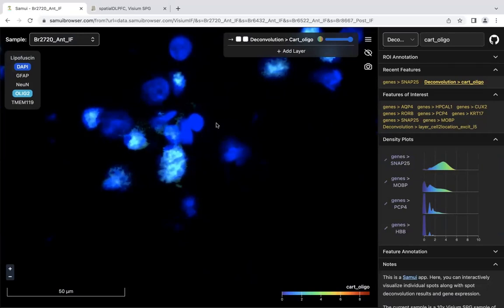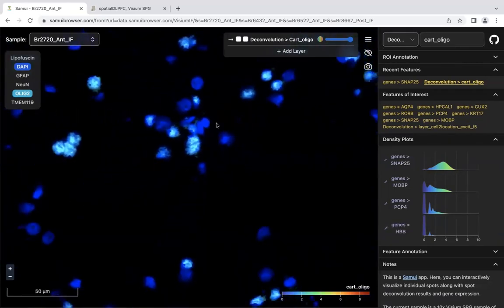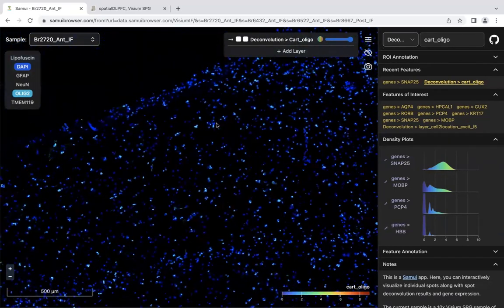In any case, you can go in and investigate some of these results interactively, which is a unique ability of this app.